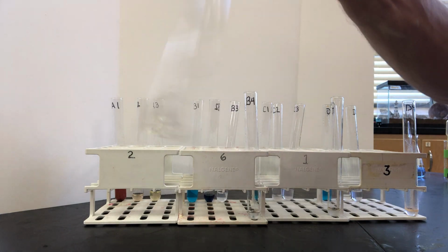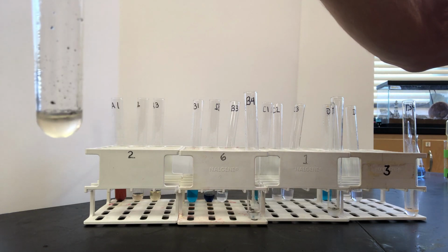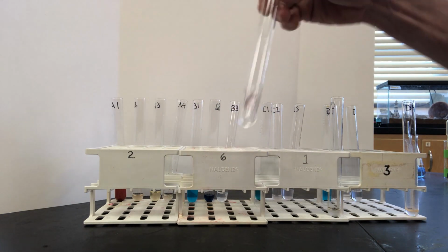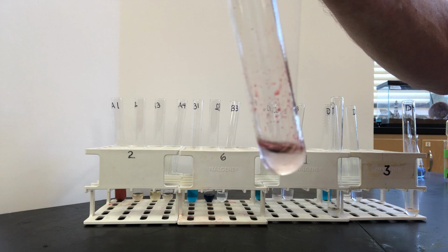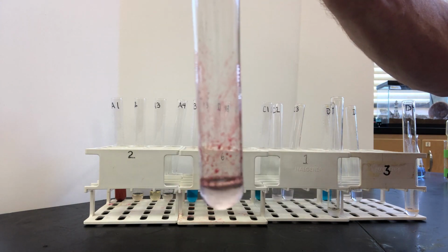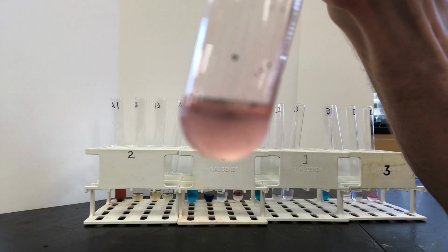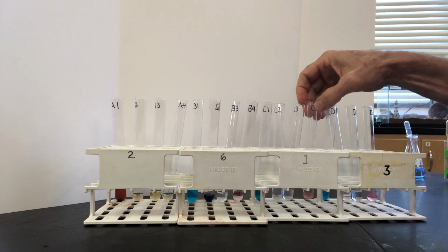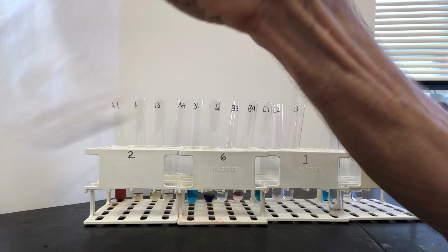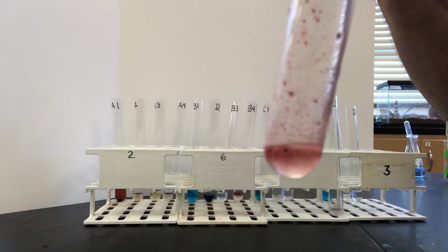The oil red O test gave the following results. A4, B4, C4, and D4. You're looking for the dye to dissolve and turn the liquid red or a reddish color.